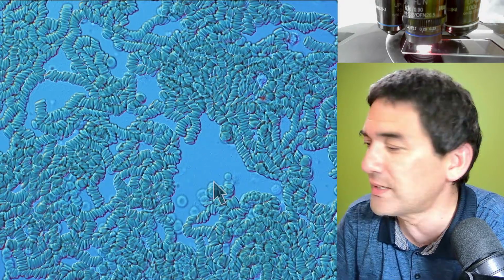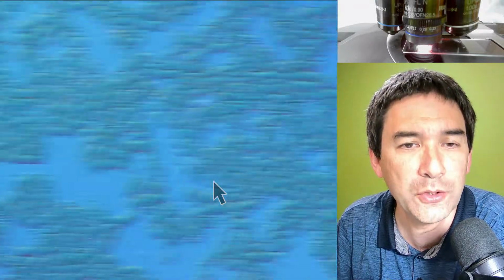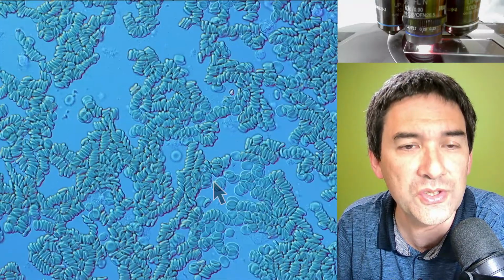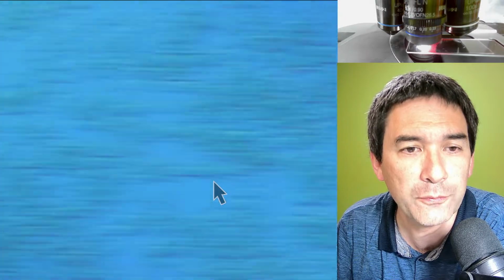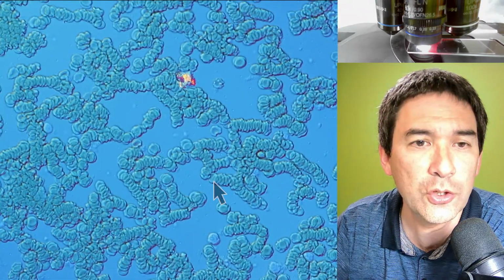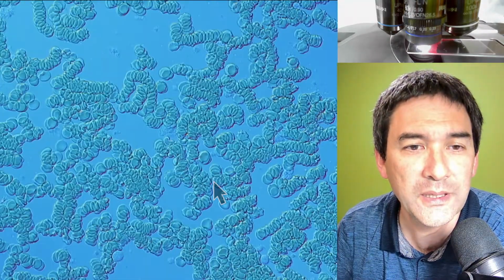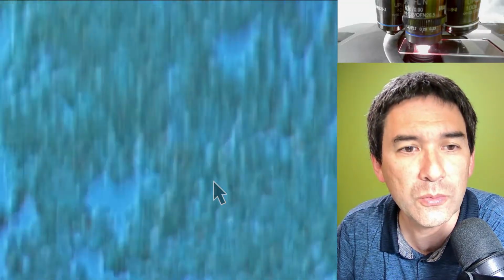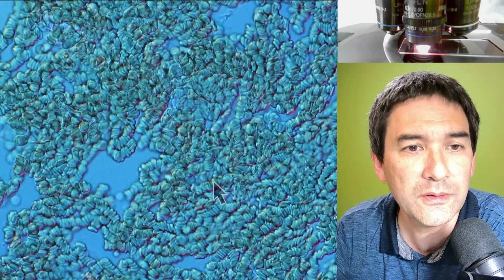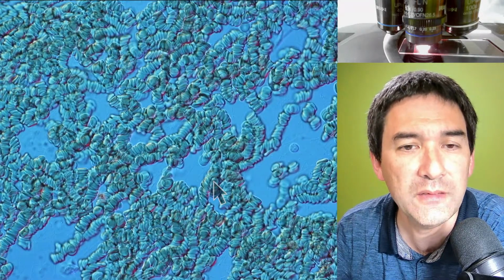So that is actually something quite normal, and sometimes this depends also a little bit on the amount of blood that you're using, because if there is a lot of pressure on the cover glass, then they're not able to stack up quite as easily. But that is essentially it. Let me move over here as well. This shows quite nicely the individual red blood cells.